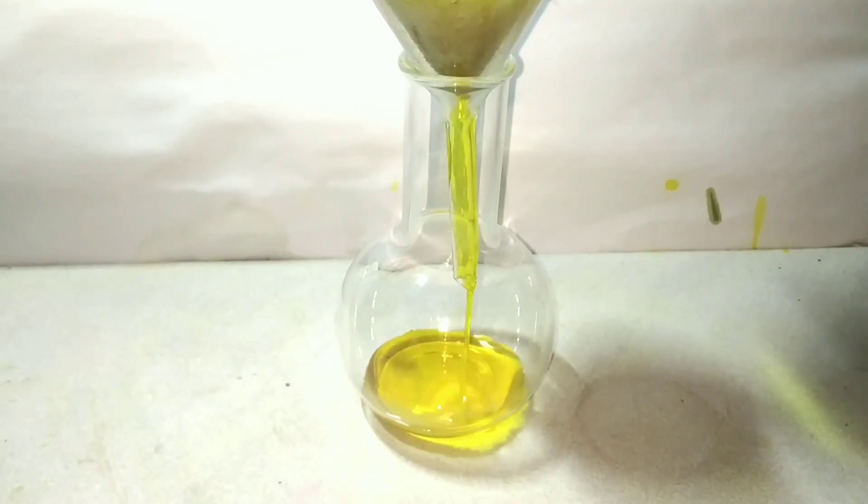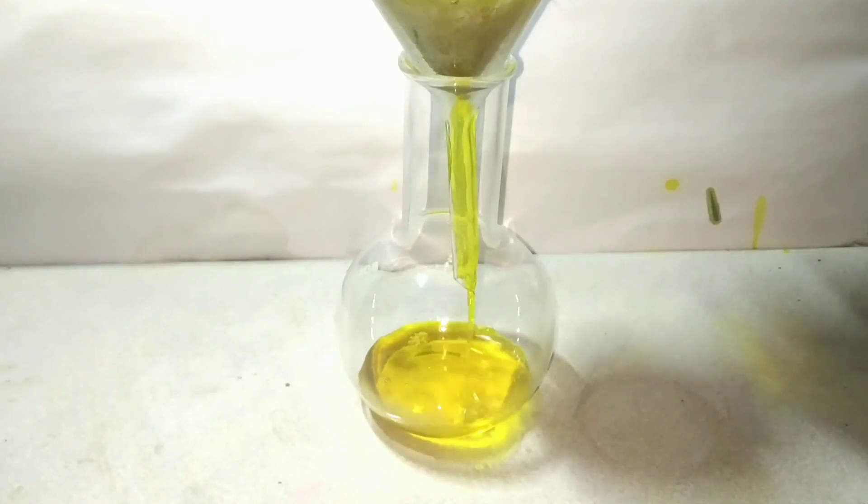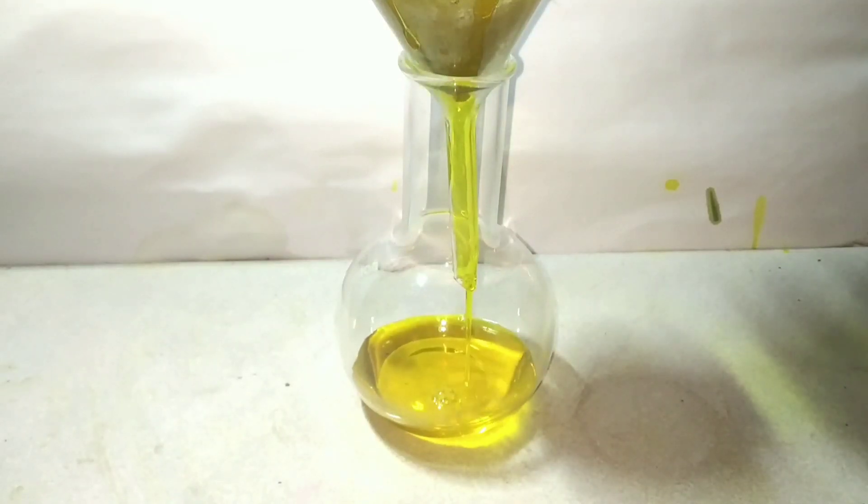I am using gravity filtration, and on filtration the filtrate appeared a nice golden yellow color. This is the potassium chromate.